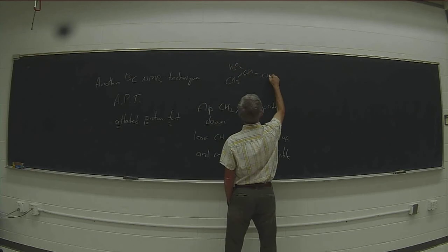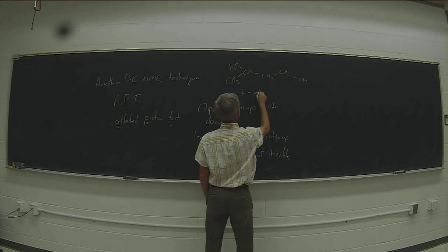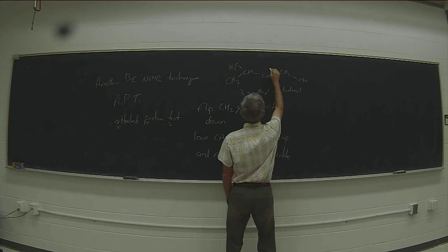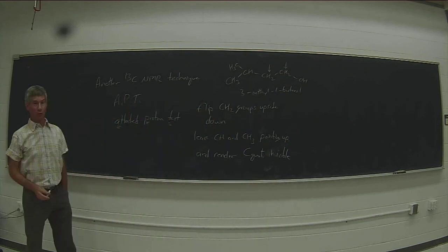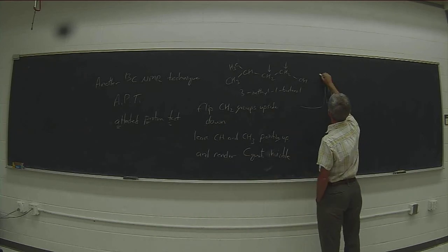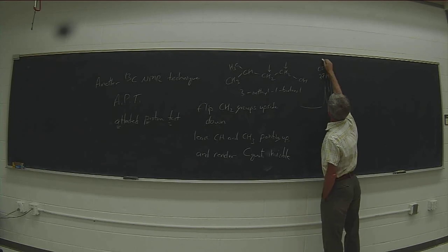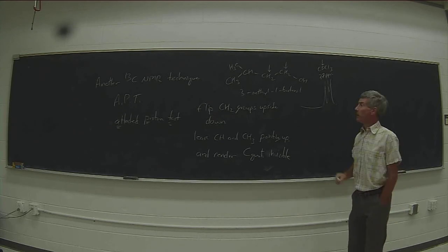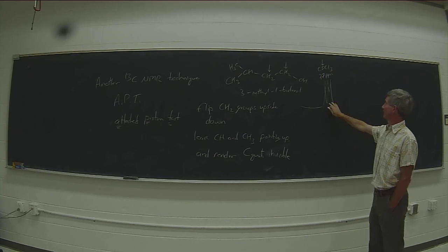if you have, say, methyl butanol, is it will take the two CH2 groups and flip them upside down. So you'd expect to see your triplet at 77 ppm for your deuterated chloroform. Since deuterium absorbs at a different frequency, the proton, even when you're decoupling proton, you're not decoupling from deuterium, so the deuterium will still split the carbon, since it has 3 spin states, into a triplet.